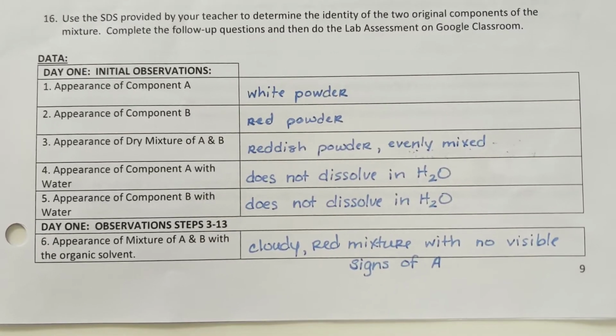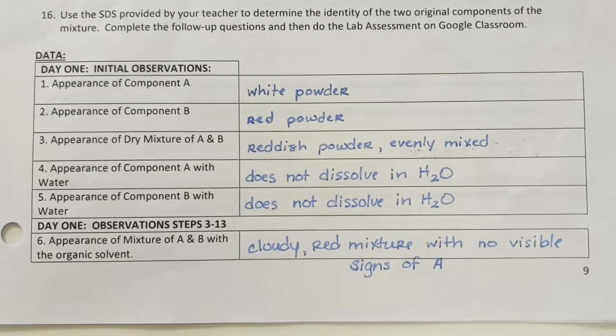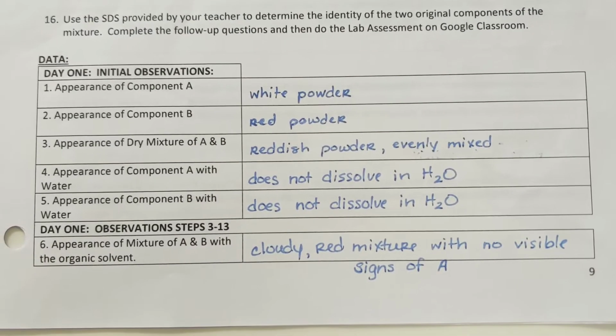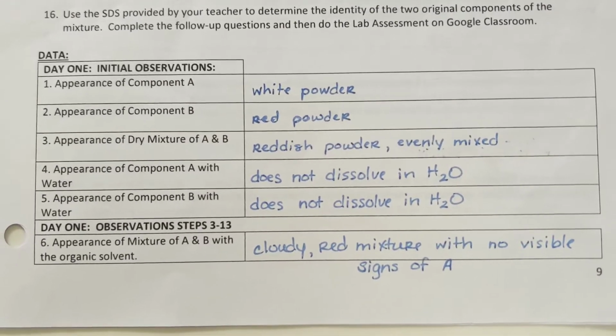When we looked at A and B in water in those test tubes, you should have noticed that it does not dissolve in water. Neither of them dissolve in water. That's going to be useful later when we're trying to identify the name of each of those substances.